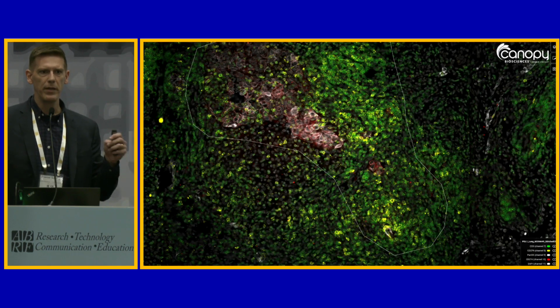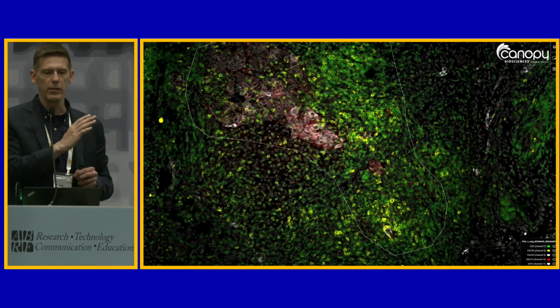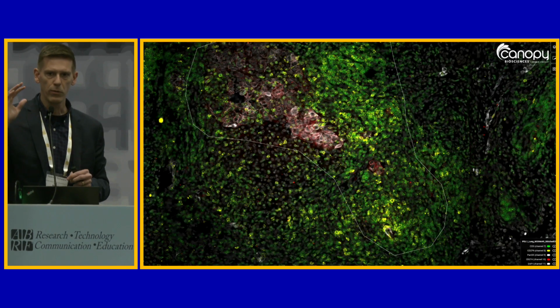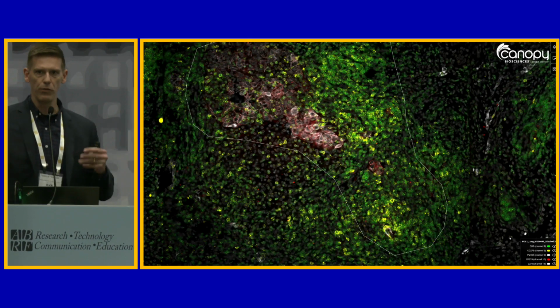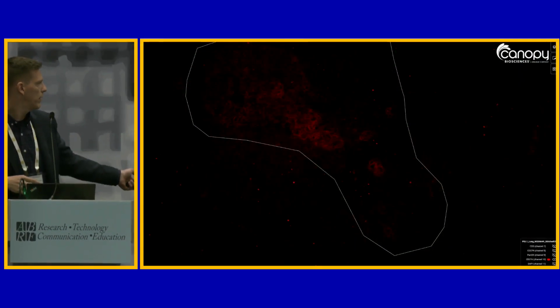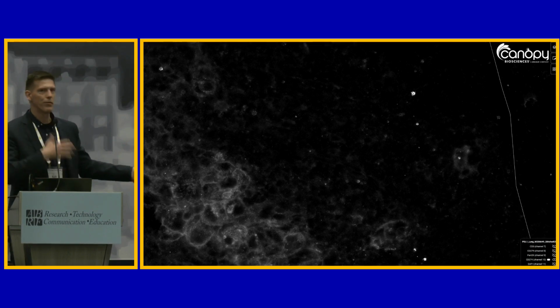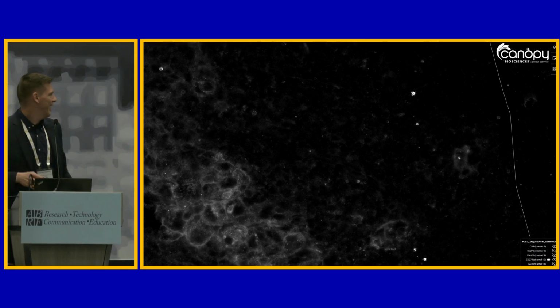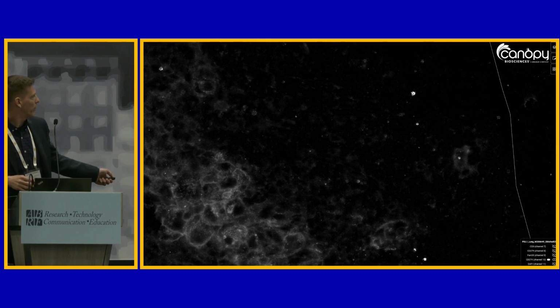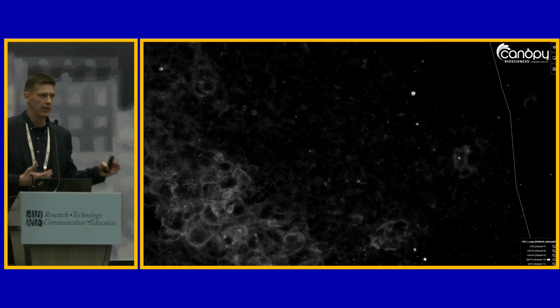So essentially what's happening here is you can see this positive feedback loop where it's not able to actually clear those cells, so it cranks up PD-1 in order to try to do that, and it's still unable to do so. But if we pull back some of these markers and just take a look at PD-L1 and zoom in a little bit, put it in mono, and of course, look at it in a bright room. Take my word for it here that there is actually some very dim PD-L1 in addition to this blazing bright PD-L1 that you see in the cancer cells.